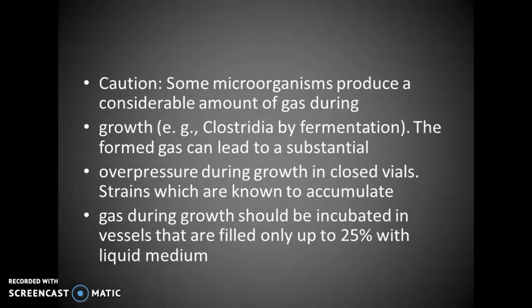So there are certain cautions we should remember. Some microorganisms produce a considerable amount of gas during growth, for example Clostridia by fermentation. The formed gas can lead to a substantial overpressure during growth in closed vials. So strains which are known to accumulate gas during growth should be incubated in vessels that are filled only up to 25% with liquid medium.